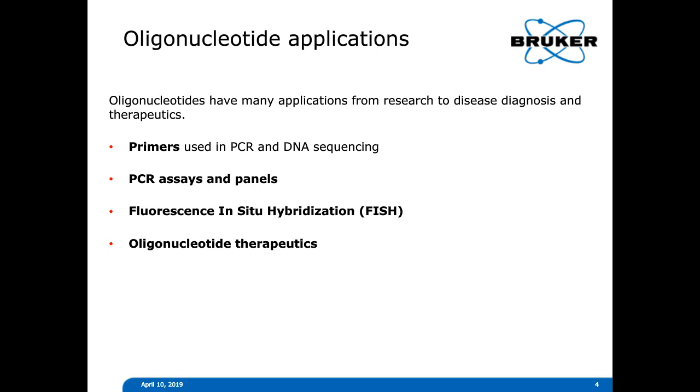Oligonucleotide therapeutics are a novel class of biopharmaceutical products comprised of short strings of synthetic nucleotides designed to alter the expression of target genes associated with disease in the body. Let's take a closer look at this class of applications.